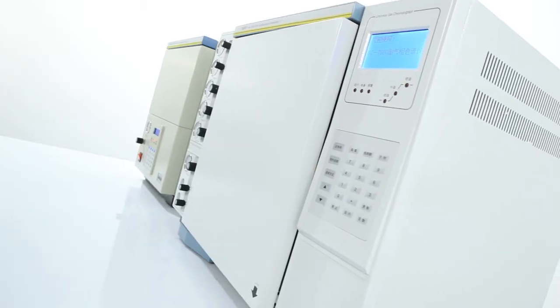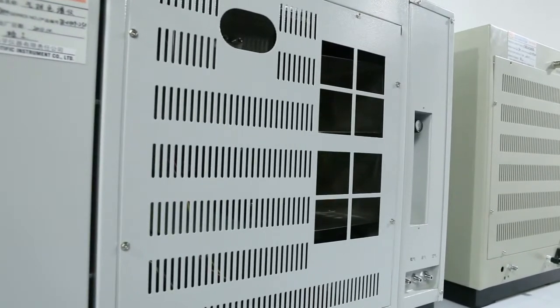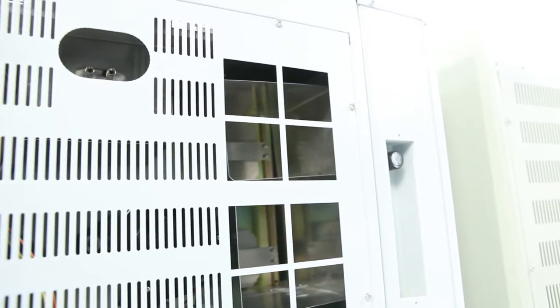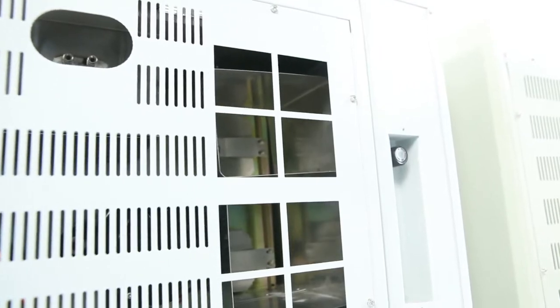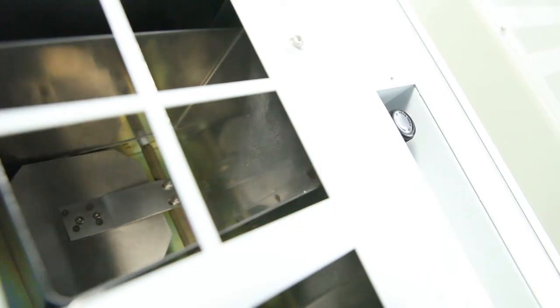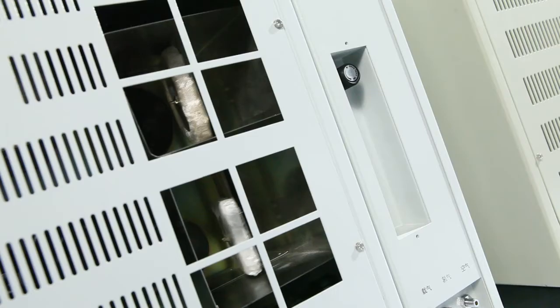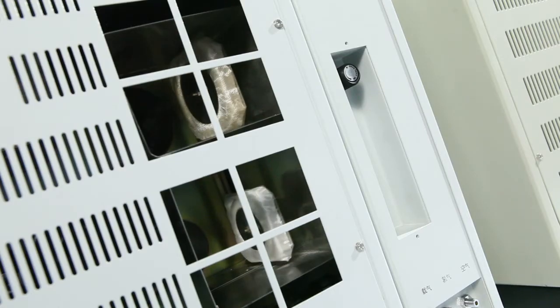The large volume oven utilizes an auto control back door which can achieve a 250 degrees centigrade temperature reduction in only 15 minutes.